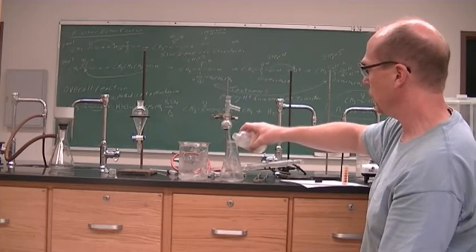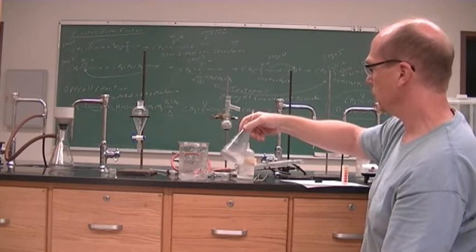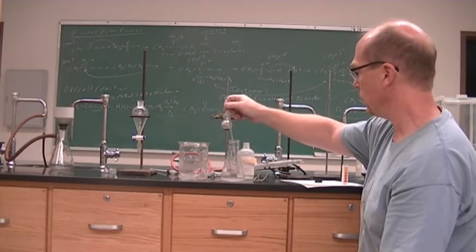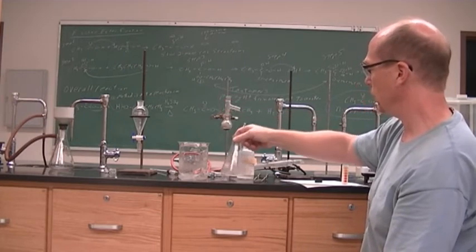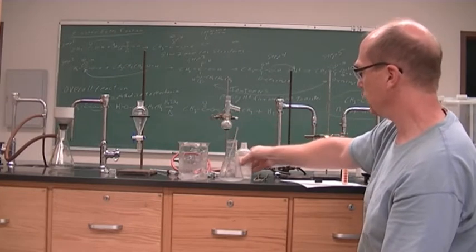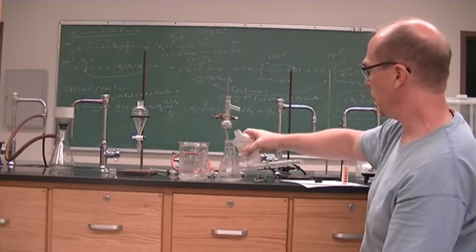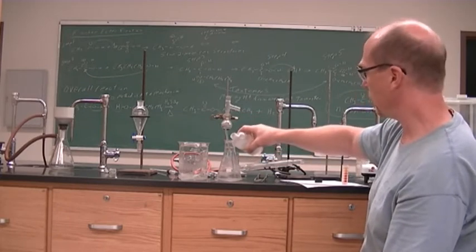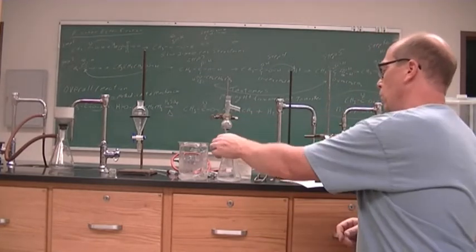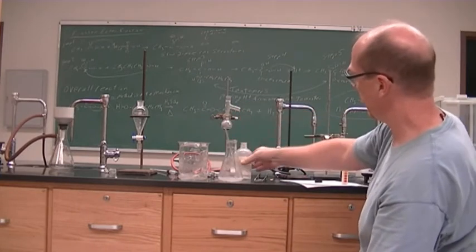So nice to have some phenolphthalein. That makes for a nice magic trick. You add two colorless solutions and then it turns pink. Amaze your friends. Now I don't have to worry about the litmus paper. I can just worry about a light pink color. So we're looking for a light pink. I know we have phenolphthalein in there.